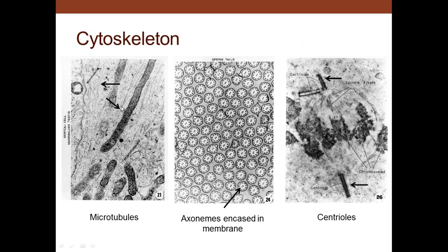Now the mitochondria, and this is microtubules. Very long microtubules. Here we see microtubules associated with chromosomes pulling apart, and also there's microtubules here as well as part of a centriole. These are stable microtubules. These and these are labile microtubules, which break down. Here we see the axoneme, which is a 9+2 microtubule arrangement, 9 doublets plus a central pair. And you see the plasma membrane around. This is cut through some sperm tails, where we are able to see the axoneme in each one of them.